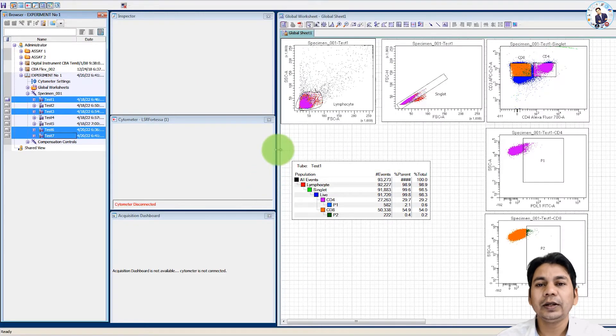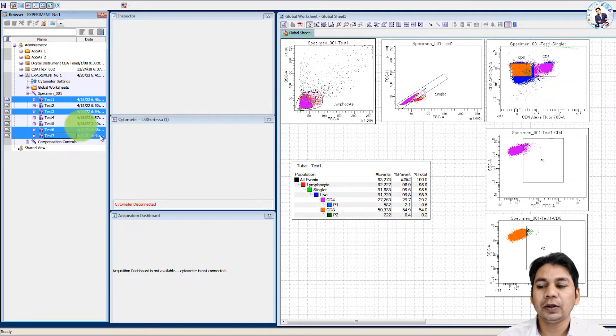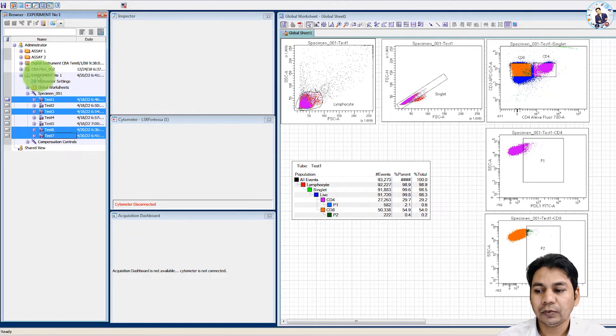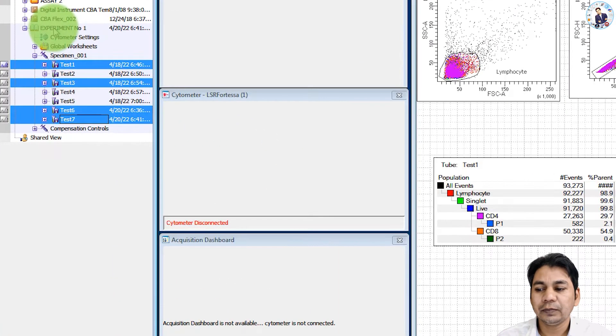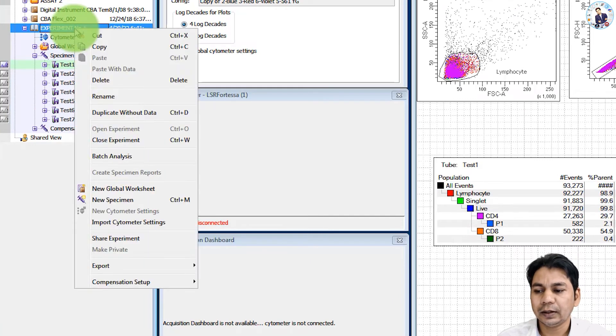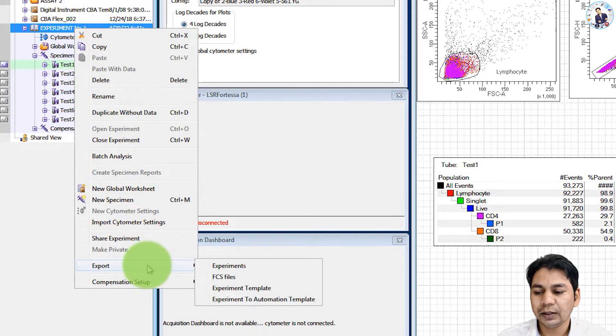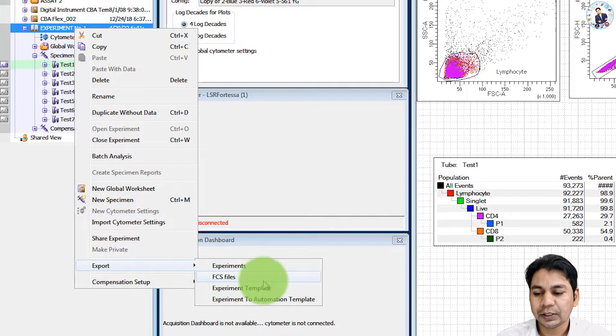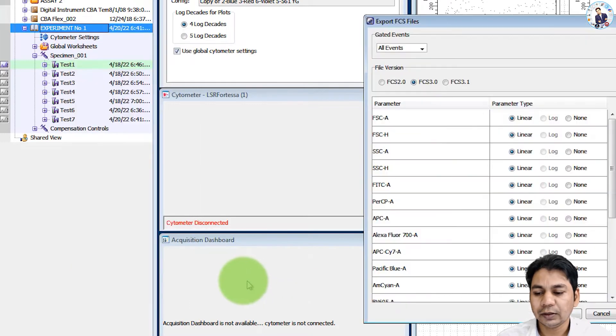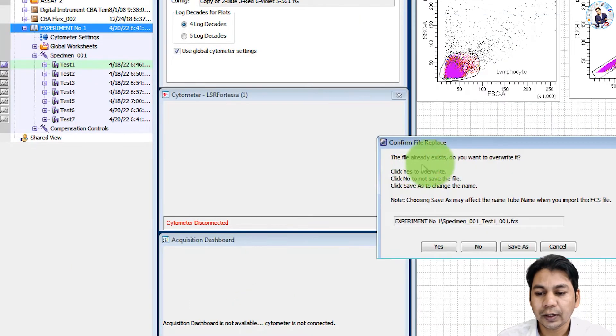You can export all the files together for this experiment. Just select this experiment and right click here and export. You can export FCS file from here.